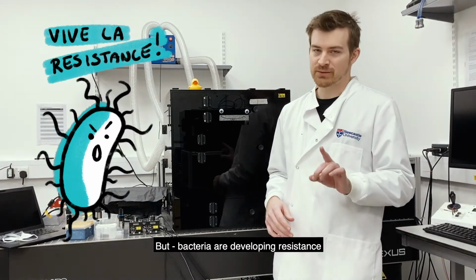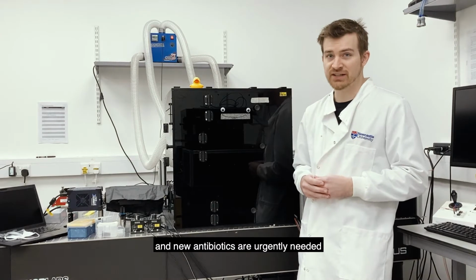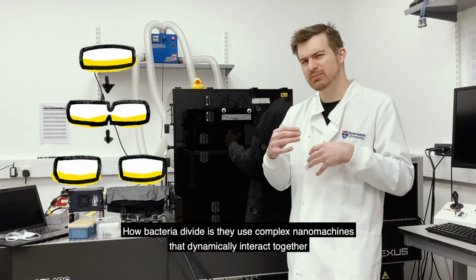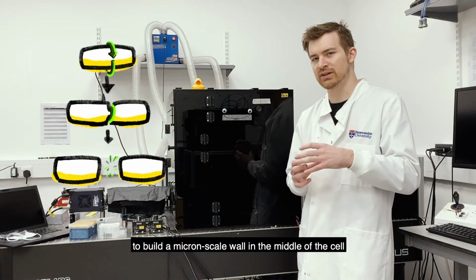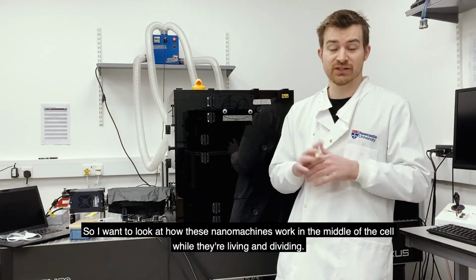But bacteria are developing resistance, and so treatments that used to be effective no longer are, and new antibiotics are urgently needed. A lot of antibiotics target bacterial cell division. How bacteria divide is they use complex nanomachines that dynamically interact together to build a micron-scale wall in the middle of the cell. And so I want to look at how these nanomachines work in the middle of the cell while they're living and dividing.